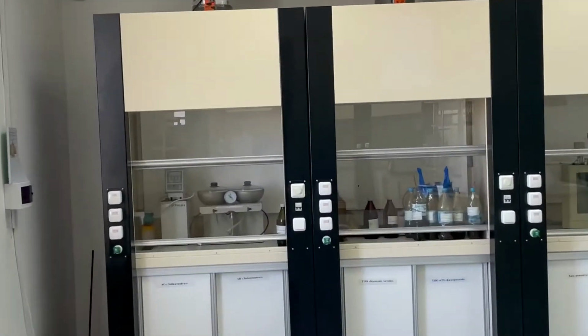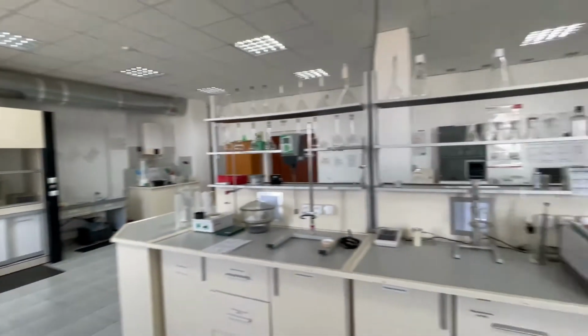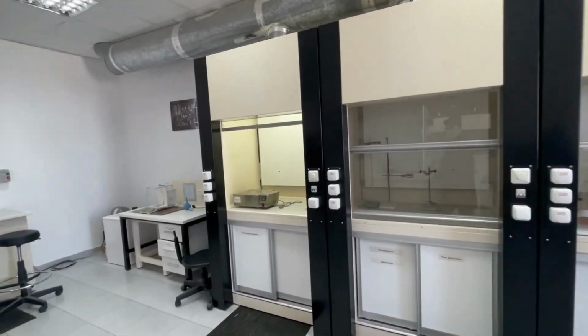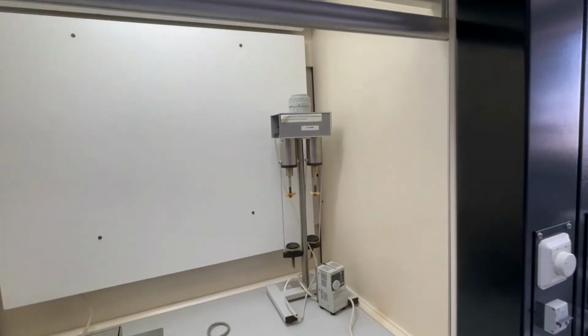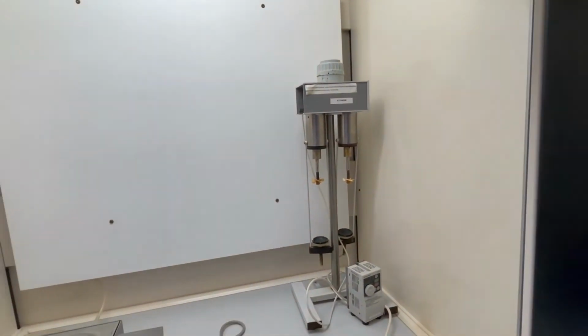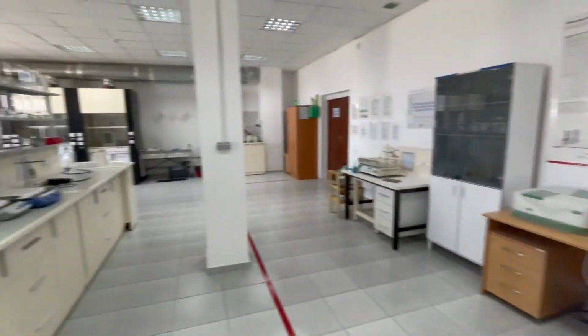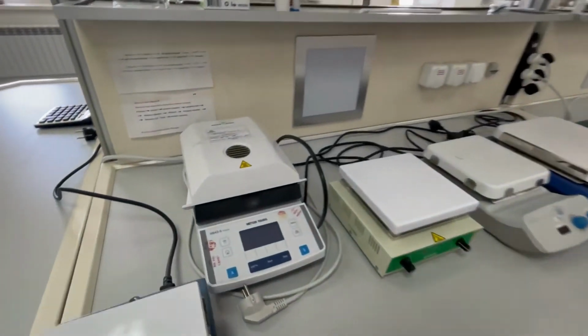And there's another equipment for mechanical impurities. And here we have an installation for assessing the protective ability of corrosion inhibitors by the gravimetric method, and many magnetic stirrers and the moisture analyzer and pH meter.